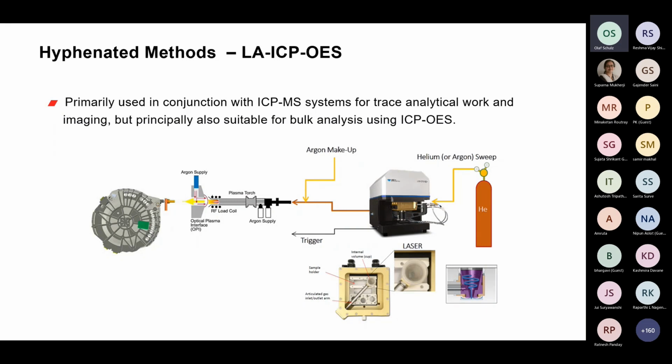And since only little material is vaporized with a single shot, ICP-OES is really only suitable for the determination of the major and the minor elements, or elements with sensitive emission lines like calcium, magnesium, or aluminium. But laser ablation systems may also be used for bulk analysis.